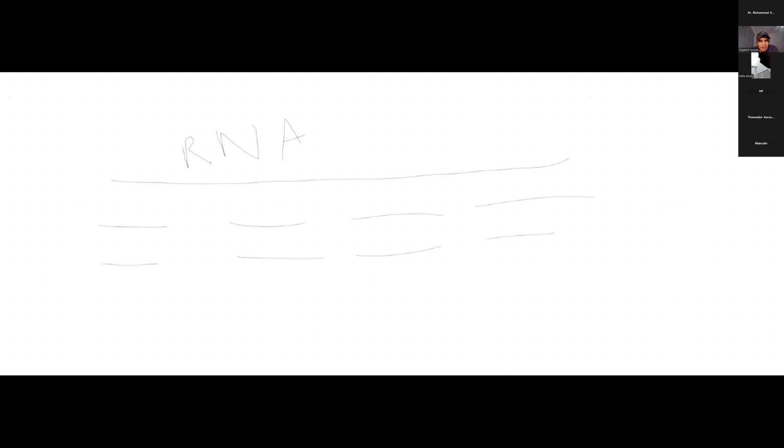If you have ever heard about the RNA integrity number, it tells us the approximate size of the fragments in our RNA, and whether the RNA is intact or not.